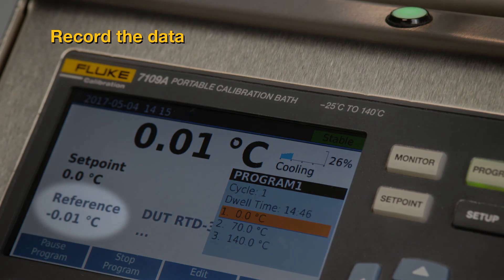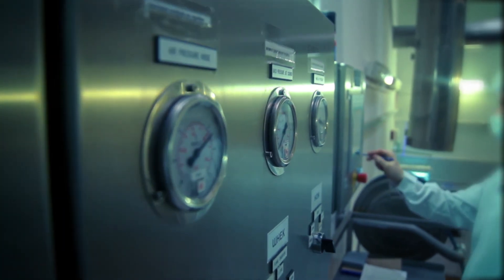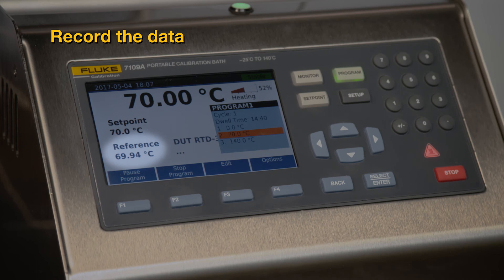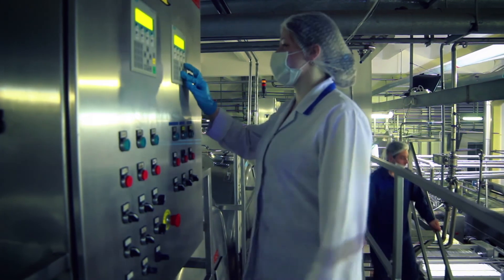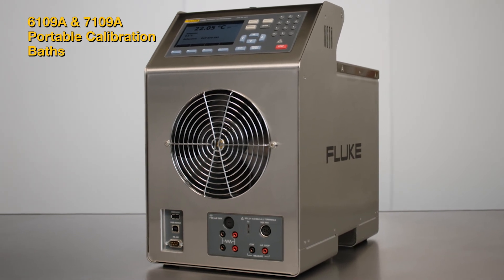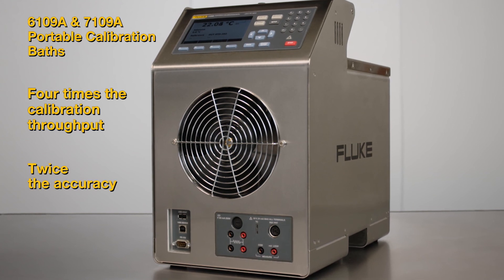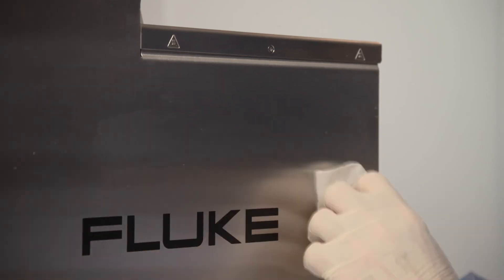Manually record the temperature of the reference thermometer at the bath. Also record the tri-clamp sensor readings at the process control station. The bath will then ramp to the next two set points, 70 and 140, respectively. Manually record the reference thermometer temperature and the tri-clamp sensor readings at the process control station for these two set points as well. The 6109A and the 7109A portable calibration baths provide four times more calibration throughput with twice the accuracy of other baths in this class. They're designed for calibration efficiency and clean room use.